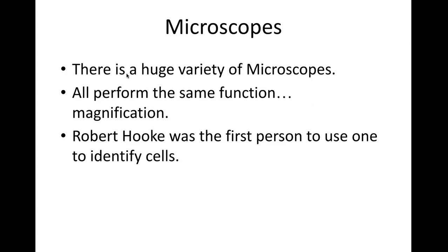There are also electron microscopes. Electron microscopes are the size of a room. Because we're looking at electrons, atoms in themselves are going to wiggle or move, and the movement of atoms makes it very difficult to focus. So if you are using an electron microscope, you would find that the room would be padded with soundproof material so that as somebody was moving around making noise, those atoms are not vibrating to the point where you couldn't focus on them. So kind of a cool piece of equipment.